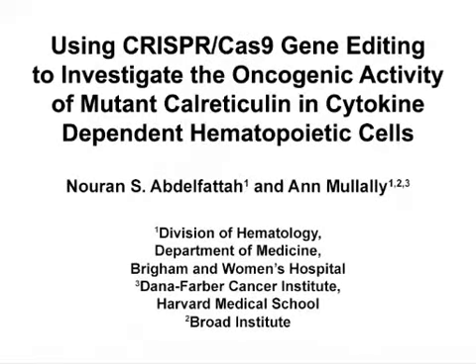The overall goal of this experiment is to utilize CRISPR-Cas9 gene editing to model calreticulin mutations in cytokine-dependent hematopoietic cells in order to study their oncogenic activity. This method can help answer key questions in the hematological malignancies field, such as the biological function of driver mutations when they are expressed at physiological levels.